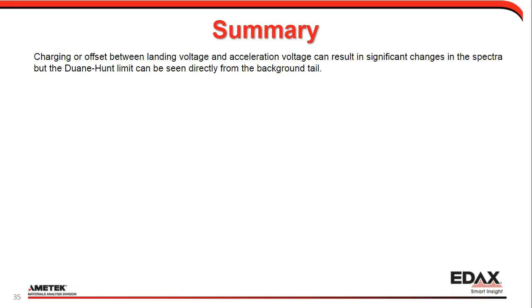That gives you two options. Either get rid of the charge buildup somehow, coating the sample or variable pressure mode, or be aware that you have charge buildup, and you can get somewhat reasonable results by changing the input parameters to the quantification model to accommodate for the charge.